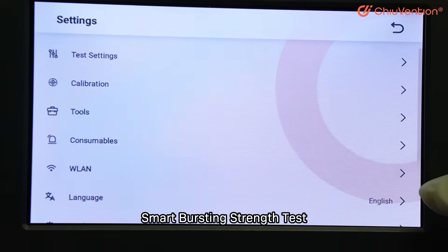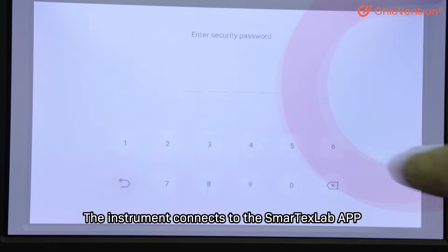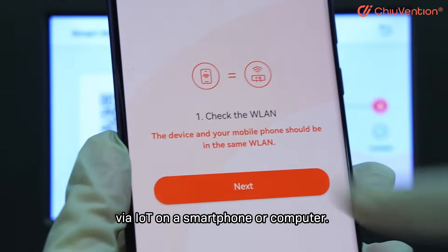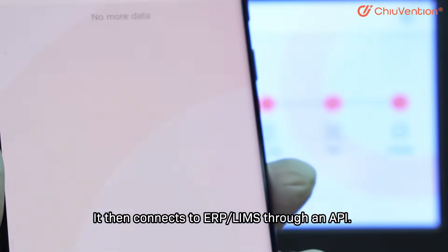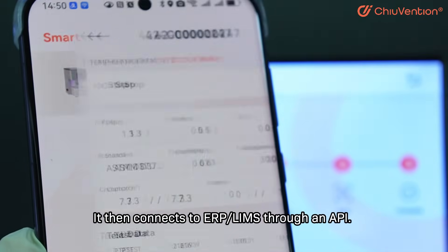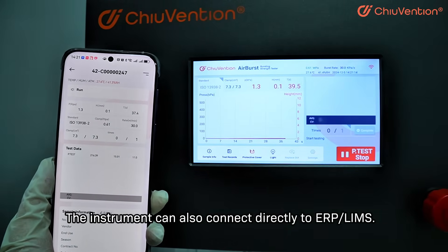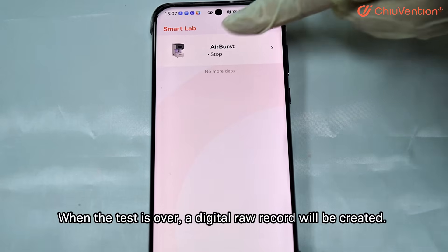The instrument connects to the SmartTex Lab app via IoT on a smartphone or computer, then connects to ERP-LIMS through an API. The instrument can also connect directly to ERP-LIMS.